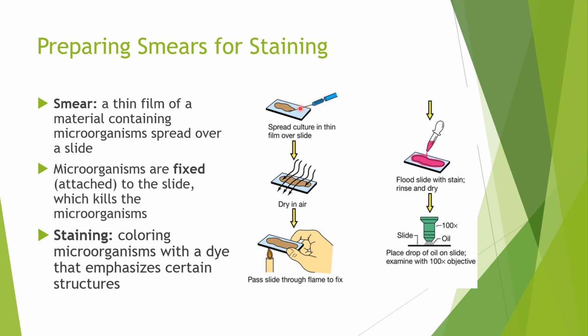For example, this tool that you're seeing right here is called the inoculating loop. Do I always have to use an inoculating loop when I'm creating my smear? No, you don't have to. There are other ways, different techniques. But the very first step of creating a slide of a specimen is to have a very thin smear or film of that microbe over your slide.